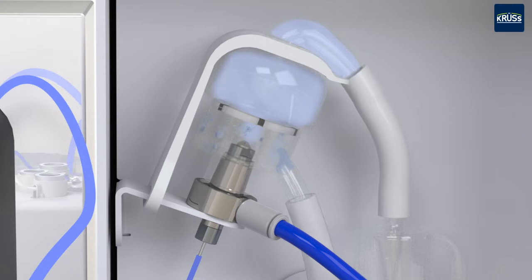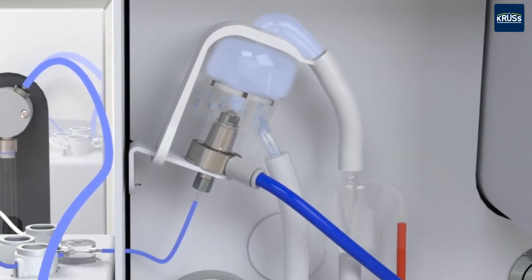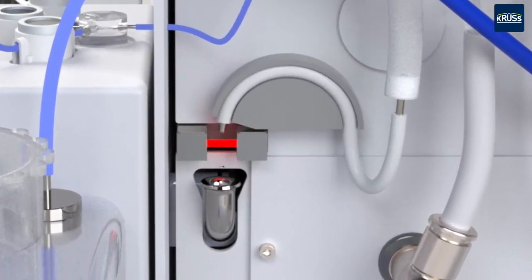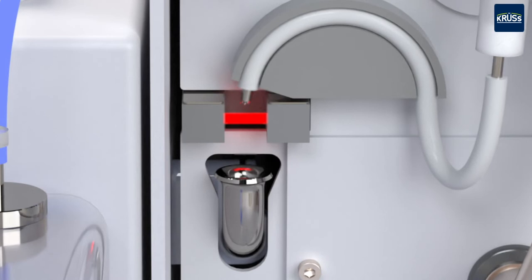Droplets with an unfitting size are collected in the nebulizer chamber and pass a drop sensor before being discarded. The drop rate detected by the sensor is used as an indicator to ensure optimal sample flow rates and nebulization.